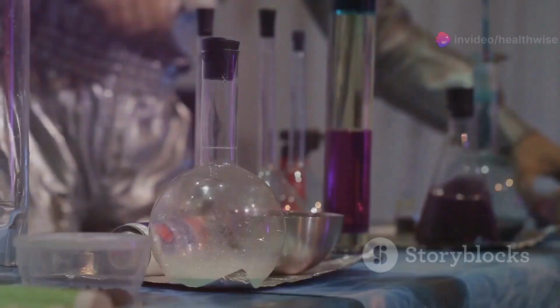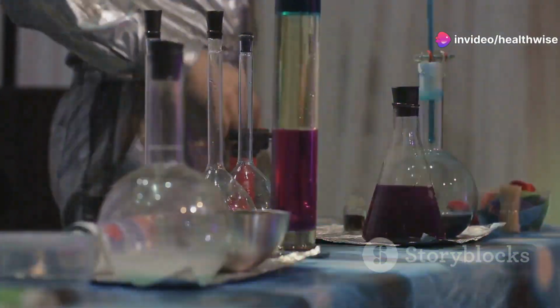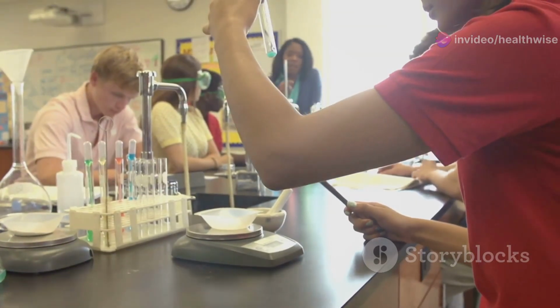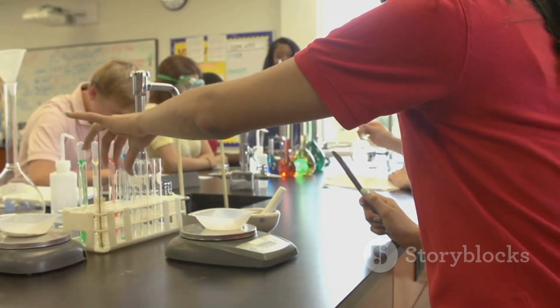So there you have it. Chromatography is an invaluable tool for identifying and separating substances in a mixture. Whether you're working in a lab or studying for an exam, understanding these basics will give you a solid foundation.